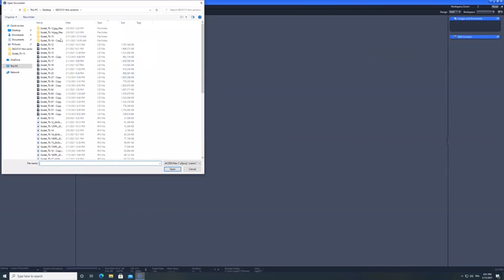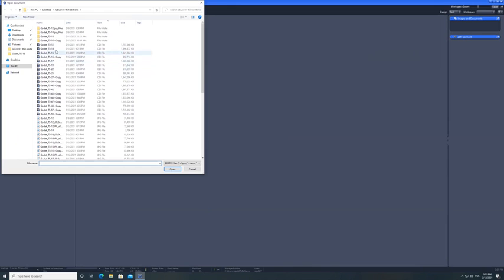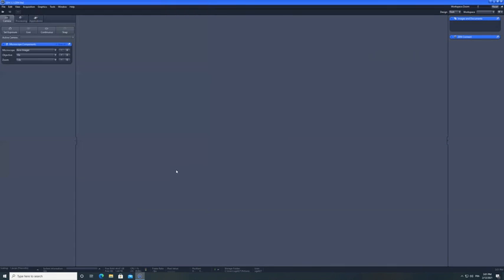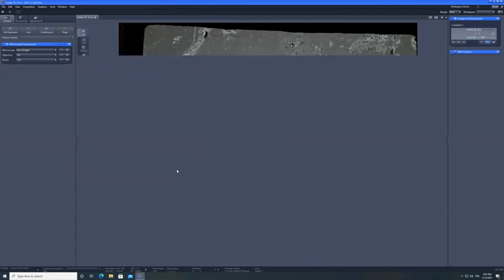And you can open one of those CZI files. So I'm going to take, for instance, the TS 12 that I think is one of the samples that is to be used for this carbonate rock.